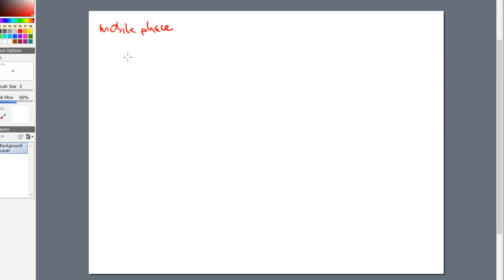So chromatography requires two phases. A stationary phase, which is something that doesn't move, and that's our plate. And then mobile phase. So mobile phase, I want you to regard as almost like a solvent. All right. In this case, it's going to be a liquid. It doesn't have to be a liquid every time, but for TLC, it normally is.